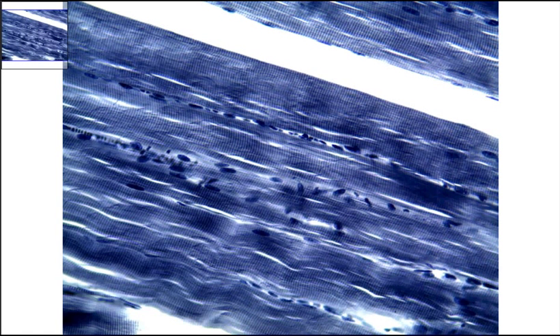This slide is skeletal muscle. These are the muscles that are attached to your bones, things like your biceps brachii, your triceps brachii. So it's the muscles you think of when you're trying to move something.